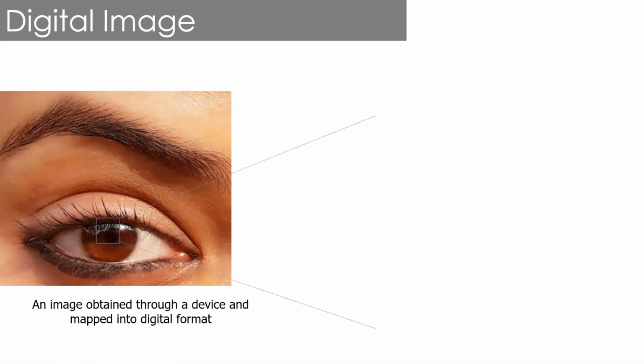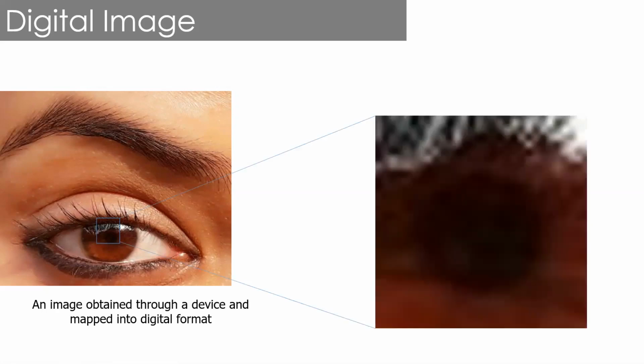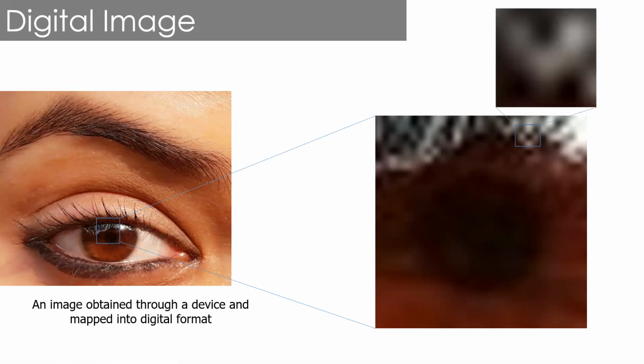So if you zoom in a little, you can see details. Further zooming, you can see more details. But for how long? Finally, you will reach the smallest detail of the image.